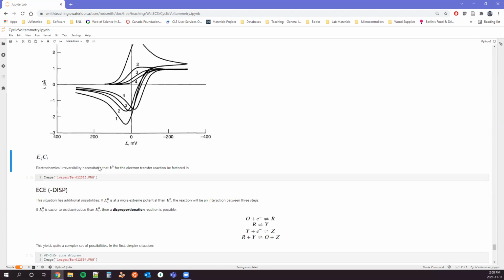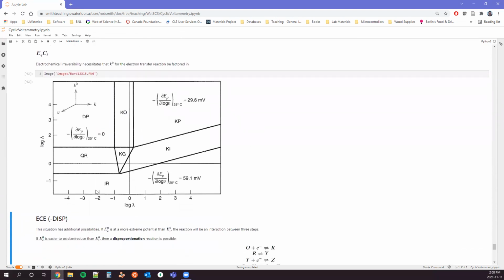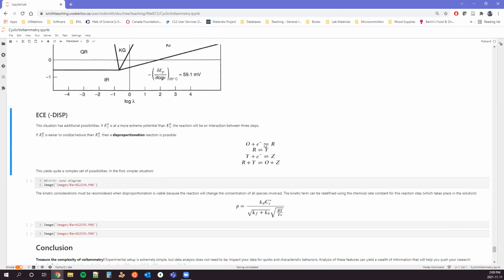We could generate working diagrams on that. And I see Jillian coming on. I'm going to very quickly go through, just show people some examples and I'll wrap it up. We have a zone diagram here for a quasi-reversible, so electron transfer kinetics factoring in, followed by an irreversible chemical reaction. And again, the complexity is going up. We're introducing more parameters that are important, and more things that we have to consider.